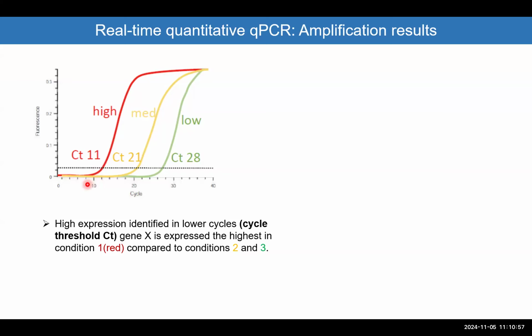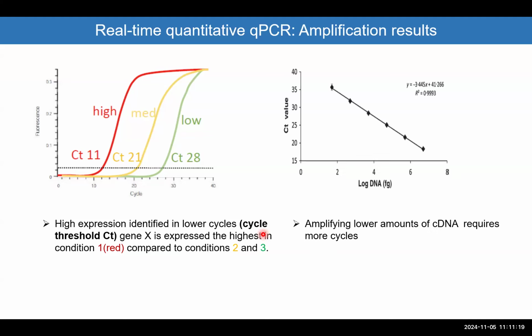Someone who is pre-diabetic, so is still producing some insulin, but not much, it shows up here. And someone who is really diabetic, who lost the expression of the insulin gene, needs much longer time to show up for the expression. So that's how we use qPCR to profile the transcriptional aspects of a disease.